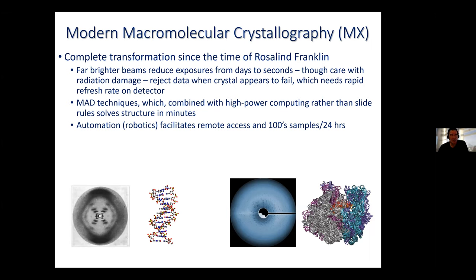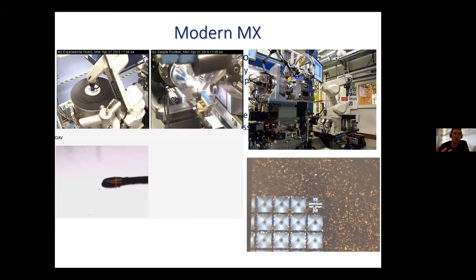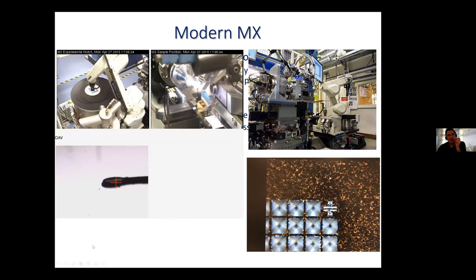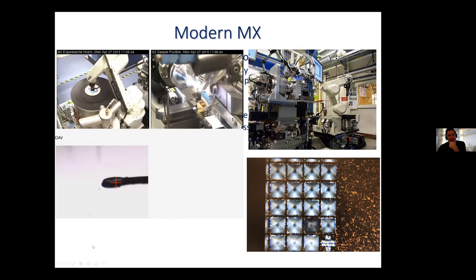And then the third thing that's critical, because we can make these measurements so quickly, it means that the bottleneck in the whole measurement process, well, first of all, is to grow the crystals in the first place. And secondly, the measurement can take a fraction of a second. The process traditionally of mounting each sample one by one in the beam would typically, even for a skilled operator, take minutes. And nowadays we've replaced the human operator by robots.